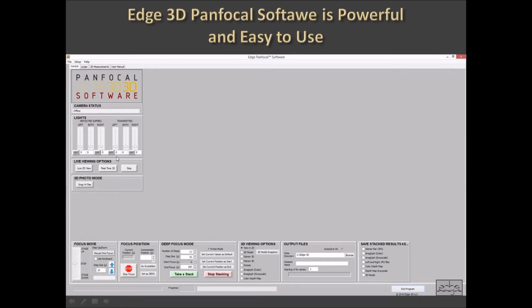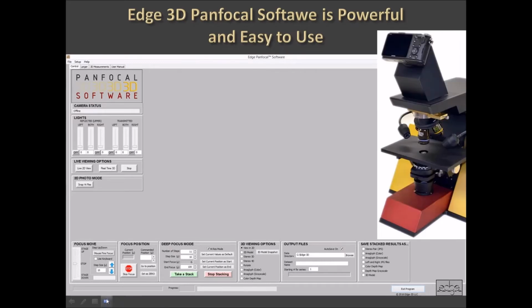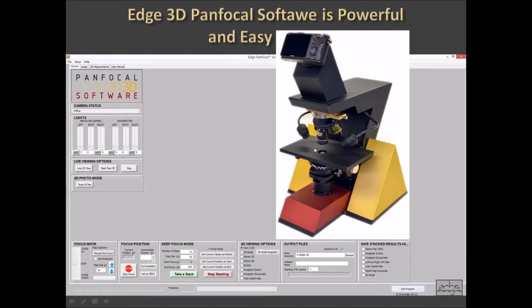One simple interface runs the entire microscope, the camera, and so forth. So as you look at this microscope here, you can see that these lights here run the reflected lights, and you can place them wherever you want. So here's the reflected lights. This bank of lights here controls the transmitted lights that come through the condenser lens into the specimen. Rather than having one light here, there's two lights here. There's a left eye light and a right eye light. And that allows you to get real-time 3D images.